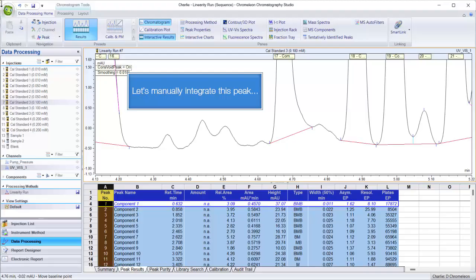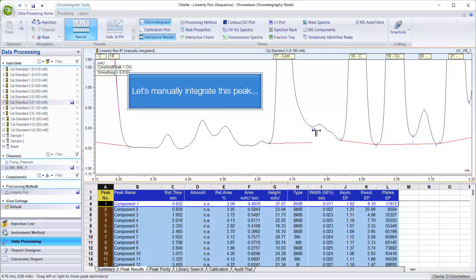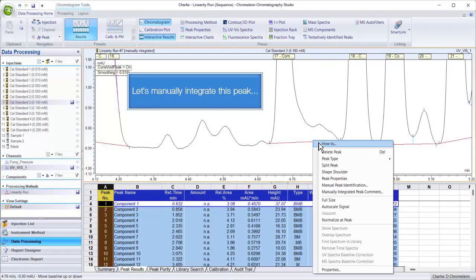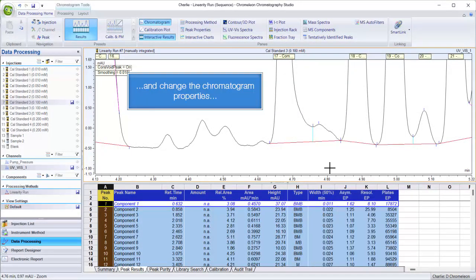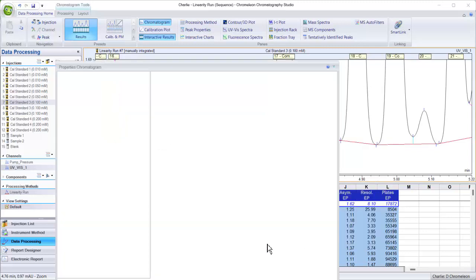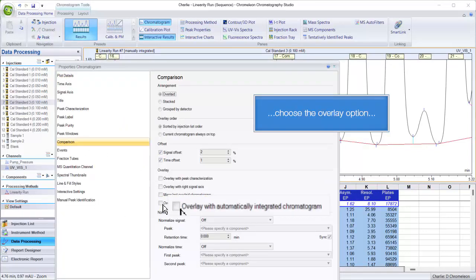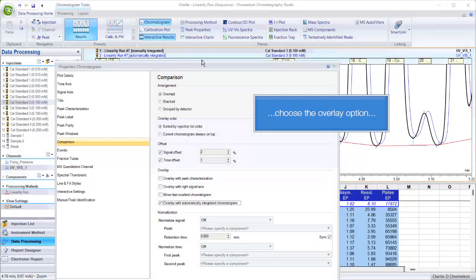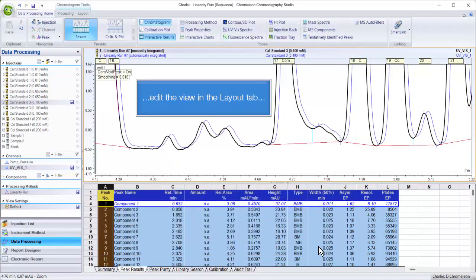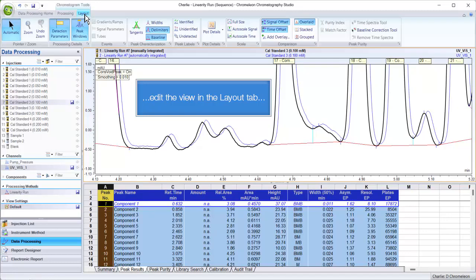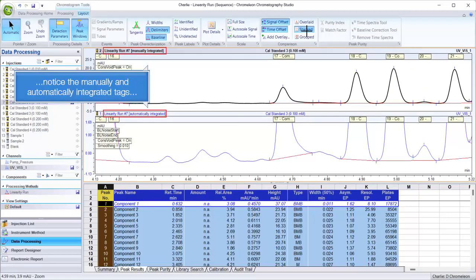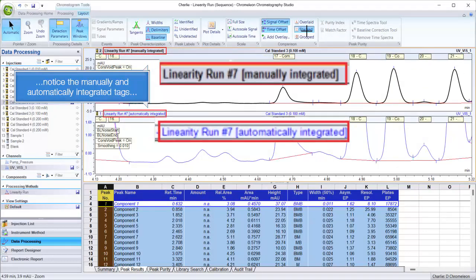Let's manually integrate this peak and change the chromatogram properties. Choose the overlay option, then edit the view in the Layout tab. Notice the manually and automatically integrated tags.